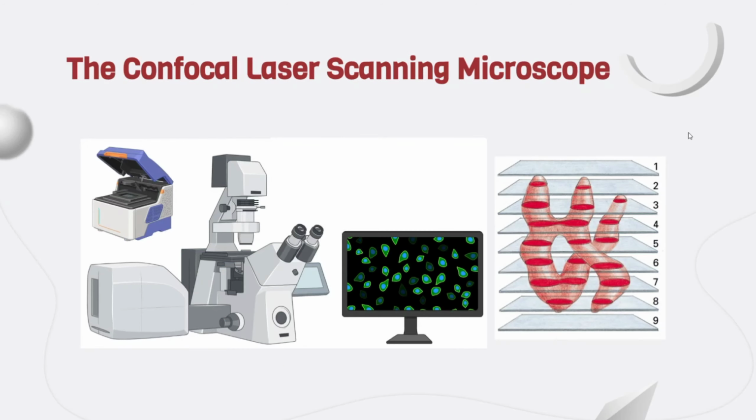The confocal laser scanning microscope scans the sample sequentially, point by point and line by line, and assembles the pixel information into one image.